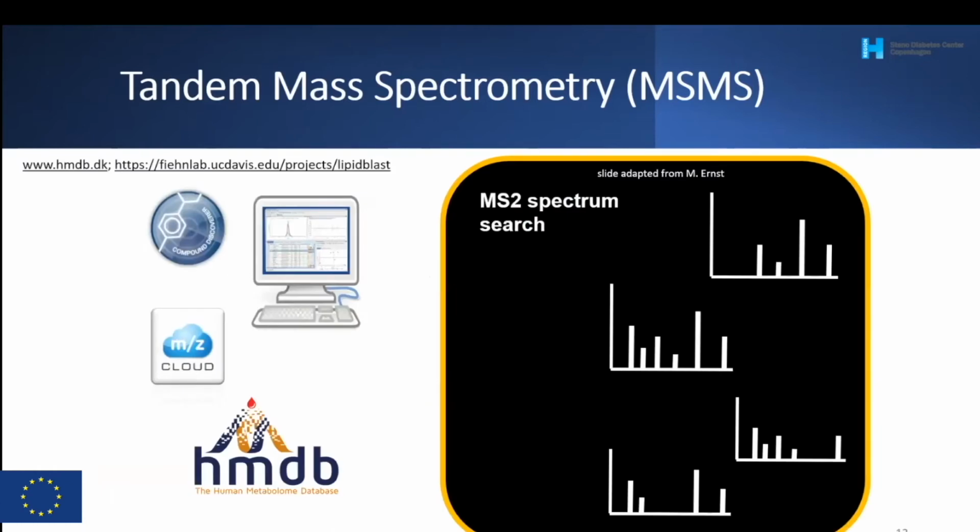And this brings me to how we actually identify the metabolites. As Andresa said, we have two ways of analyzing molecules: untargeted and targeted metabolomics. In untargeted, we are going to have a lot of unknowns, but we can identify some of them using so-called spectral libraries. We have a molecule and a mass spectrum, the green one, and we match it to what is in the libraries.